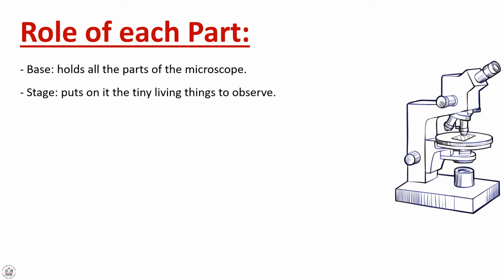While the stage puts in it the tiny living things to observe. Eyepiece, it's a lens that magnifies from 10 to 15.